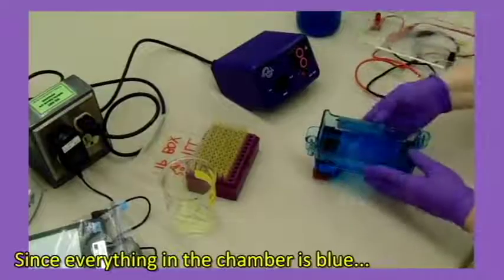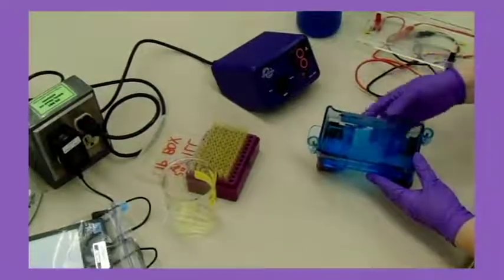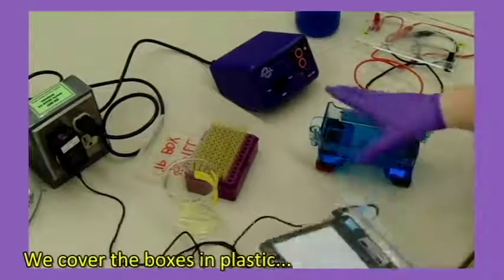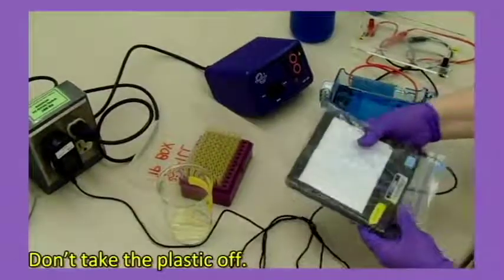Since everything in the chamber is blue, you may not be able to see the bands of DNA yet. We'll use a light box to get a better look. We cover the boxes in plastic to keep the liquid buffer off of them. Don't take the plastic off.